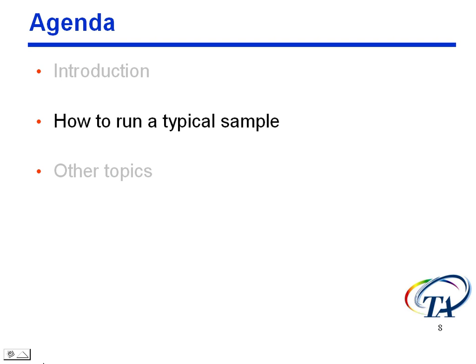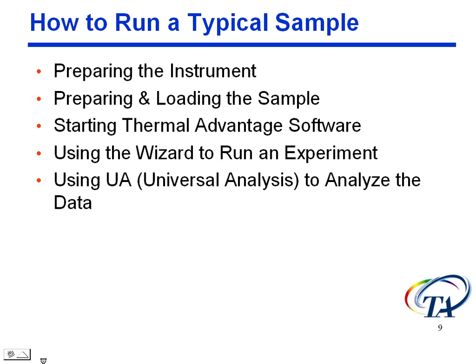Now let's go through how we would run a typical sample. This is our agenda for that. We're going to go through preparing the instrument, preparing and loading the sample, starting the software, using the wizard, and then using Universal Analysis, or UA, to analyze the data.